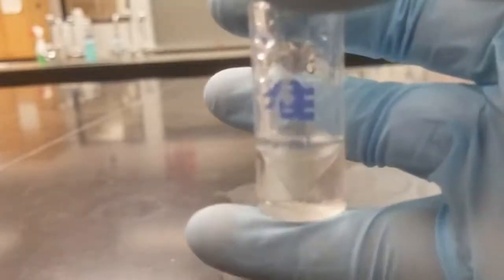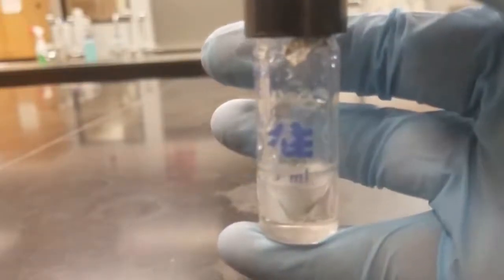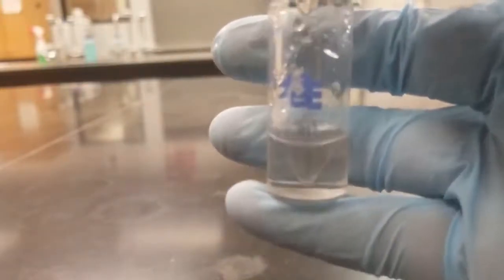Close it back up. Give it another good shake. And then go ahead and just let the two layers separate out. Cool.